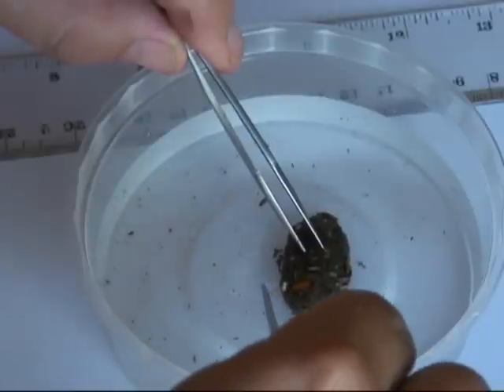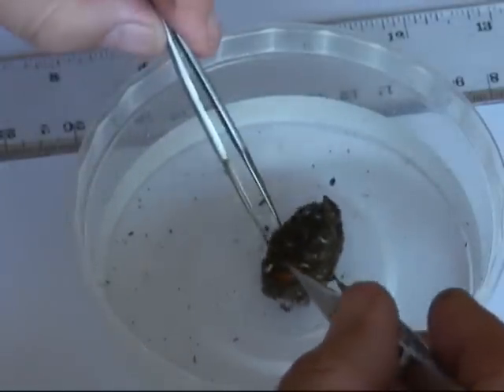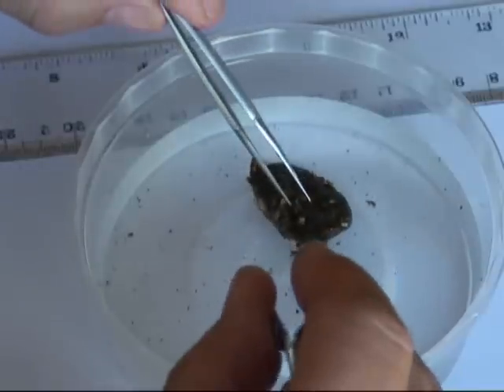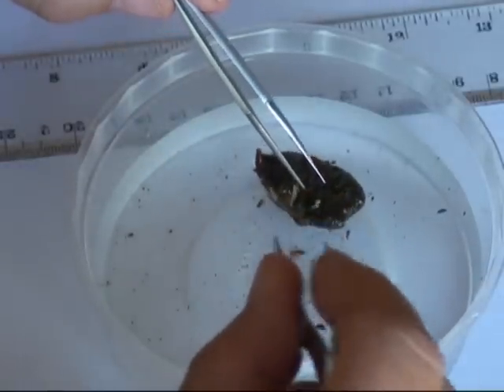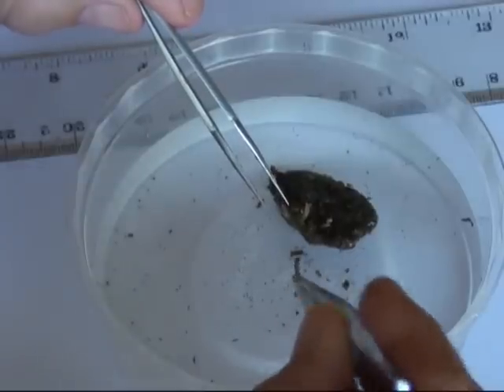We can now place one of the pellets into a container of water, then gently tease out the pieces of prey from the pellet matrix. If you don't have tweezers, toothpicks make great tools for doing this. This looks like a small piece of bone.